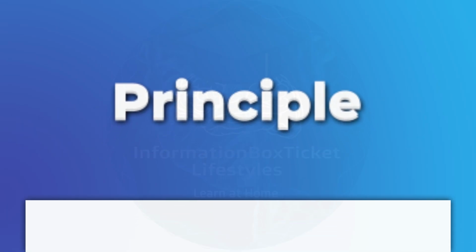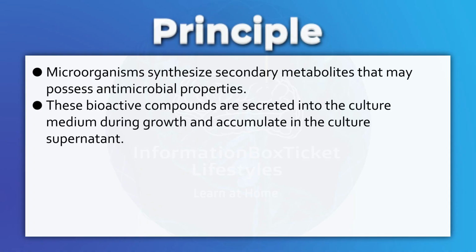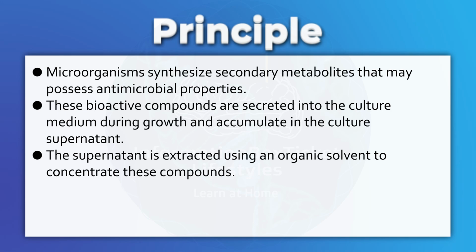Principle. Microorganisms synthesize secondary metabolites that may possess antimicrobial properties. These bioactive compounds are secreted into the culture medium during growth and accumulate in the culture supernatant. The supernatant is extracted using an organic solvent to concentrate these compounds.